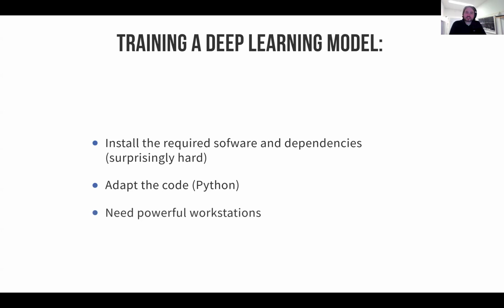However, it's not always straightforward to train. For us, it's really important to be able to train our own model, because the power of deep learning is really to teach the software to do something. So you really need to be able to train it using your own data sets. When I started with this maybe 4 years ago or so, I hit a lot of barriers. I'm not a computer scientist by trade.